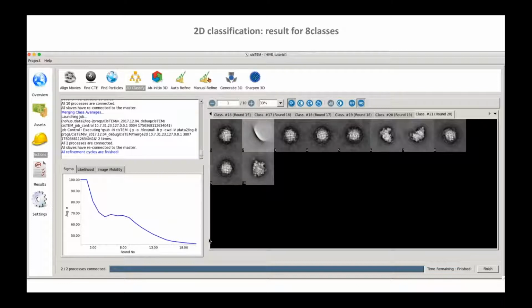I guess, how do you define that it's a good cross correlation or not? This is a clustering problem, right? This is your traditional clustering classification problem in computer science, and you have to define a metric where your signal is at a specific resolution above noise, and then in principle you can choose an optimal number of classes, right? But in practice, we just try different ends.